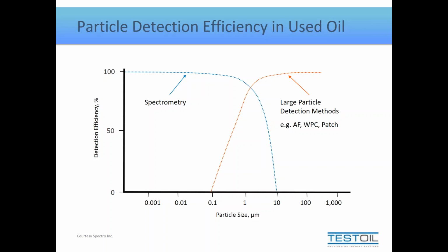Another choice that you always have is EDXRF, energy dispersive X-ray fluorescence. It is a form of spectroscopy similar to what I've described here in that it does measure elemental concentration. It does do about 20 different elements simultaneously. The difference is that rather than ionizing it in a plasma, we're exciting it using X-rays, and it is not limited to particle size at all. So it will give us everything from near zero up to pretty much any size you want. So that's another choice, but again, it's still just an elemental concentration.